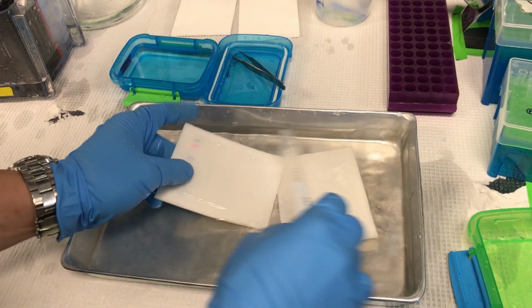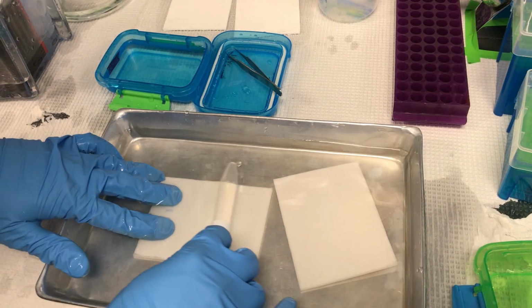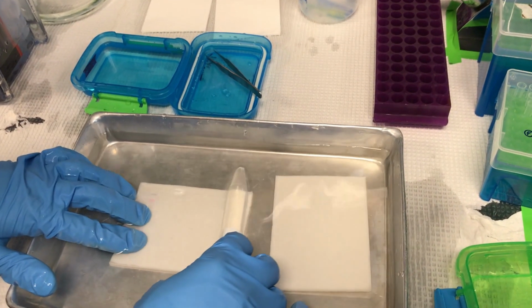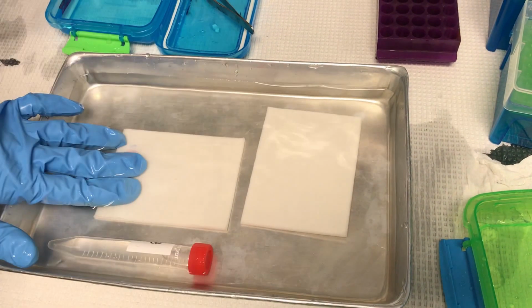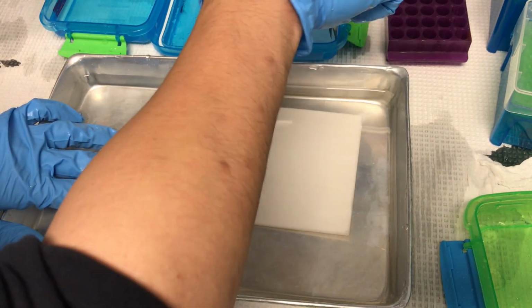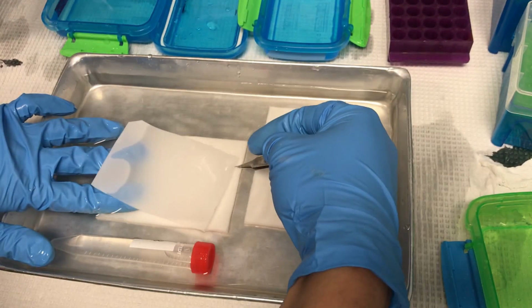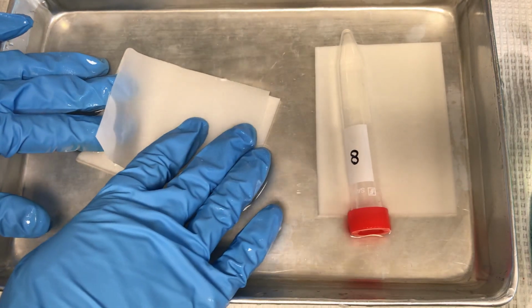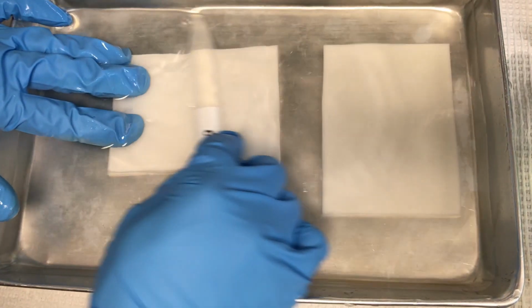Have the gel out. Roll out the gel gently to remove any air bubbles, as they will affect the protein transfer. And then step 3 is to get your membrane and lay it on top. To ensure the proteins transfer properly, align the cut corner of the gel to the cut corner of the membrane. Lay the PVDF membrane on top of the gel and roll out any air bubbles.